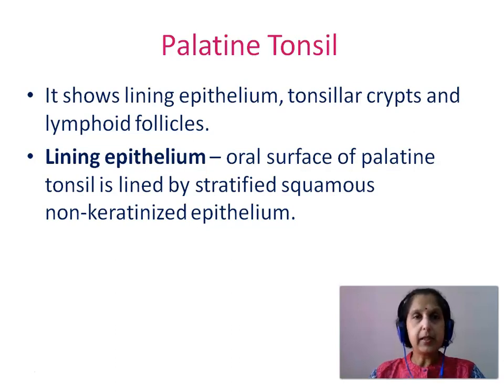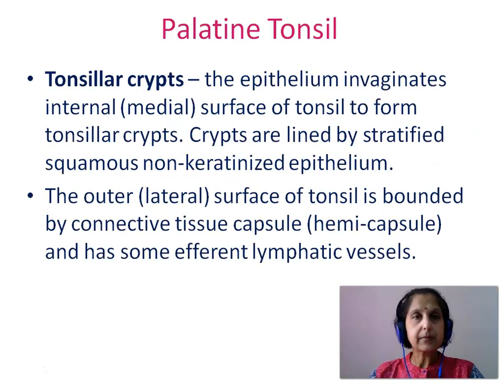Lining epithelium. The oral surface of the palatine tonsil, or the inner or the medial surface, is lined by stratified squamous non-keratinized epithelium. Tonsillar crypts. The epithelium invaginates the internal or oral or medial surface of the palatine tonsil to form tonsillar crypts. These crypts are lined by stratified squamous non-keratinized epithelium.